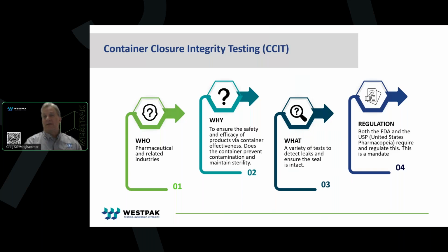So a little bit about container closure integrity testing. If you signed up for the webinar, you probably already know about this testing, but if you don't, we're going to start at a high level and drill down from there. So CCIT stands for Container Closure Integrity Testing.